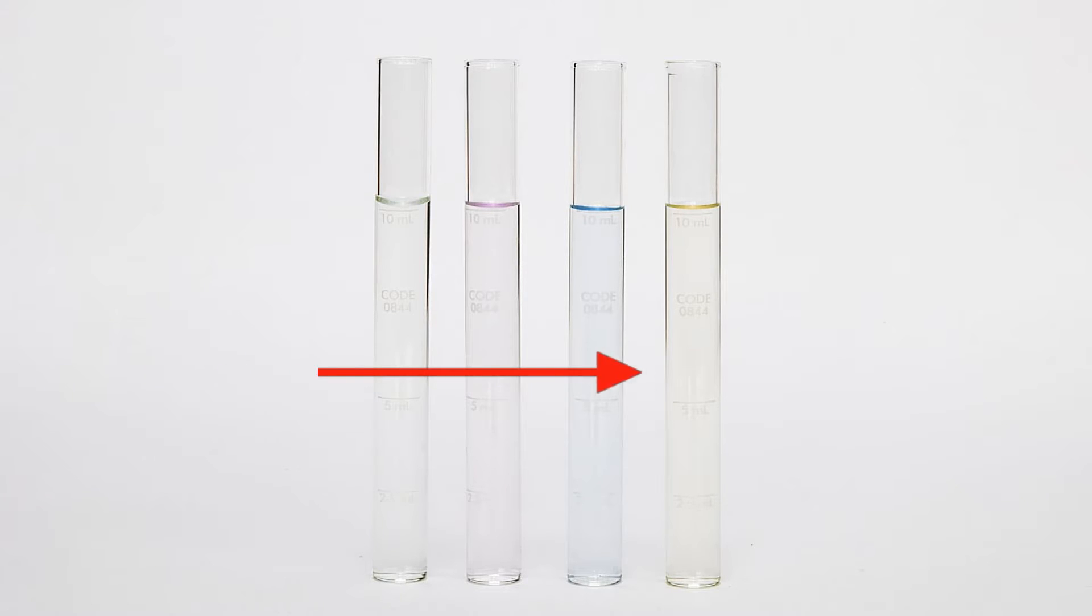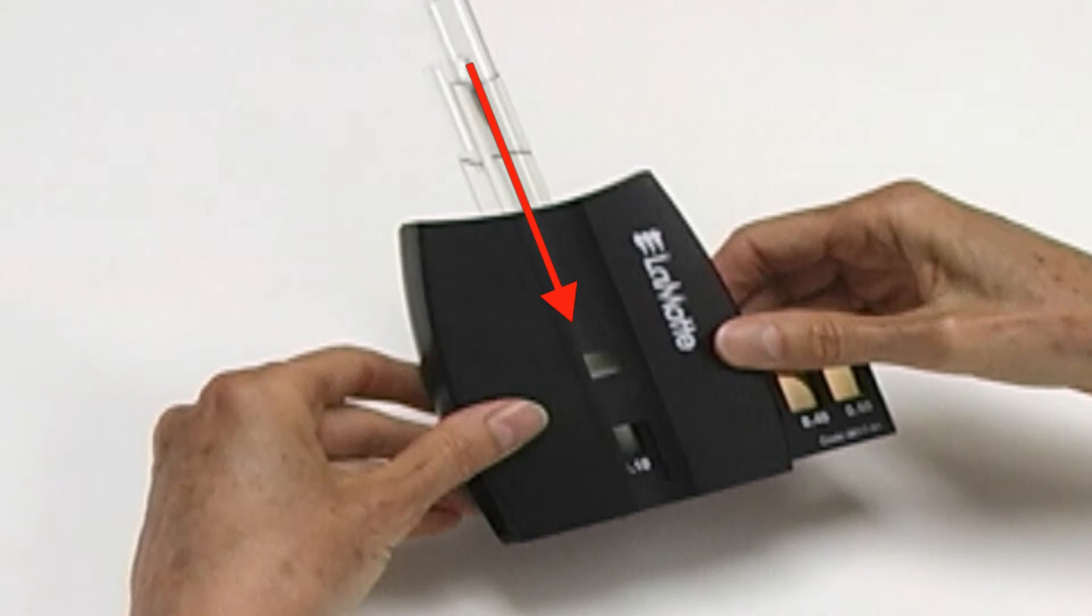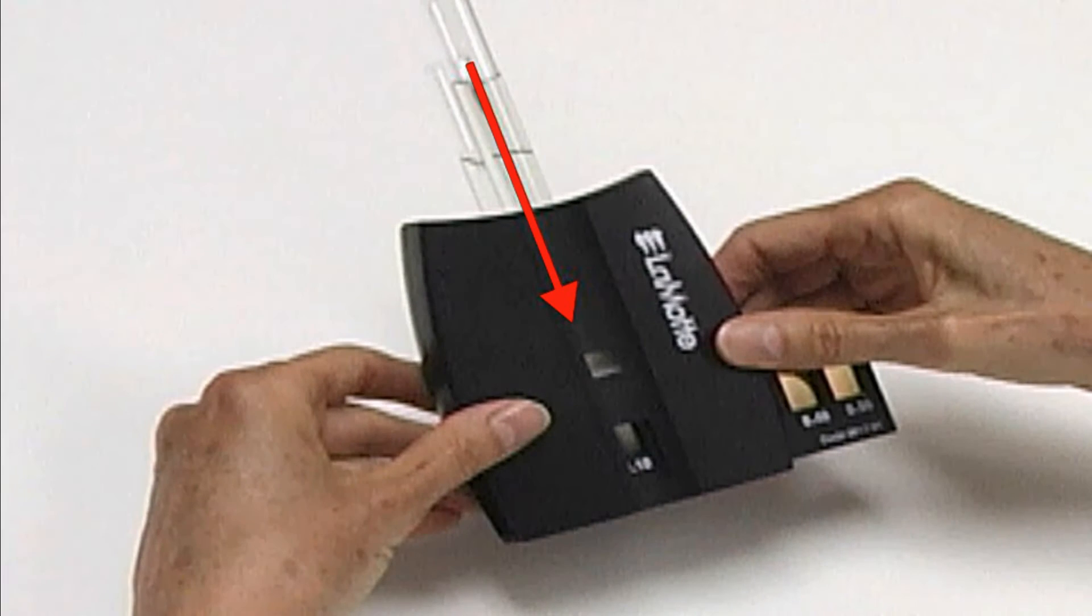When test reactions produce extremely faint colors, it's difficult to match colors looking across the diameter of a test tube. Using the low range comparator, the sample is viewed down the length of the tube. This increases the path length ten times and concentrates the color.